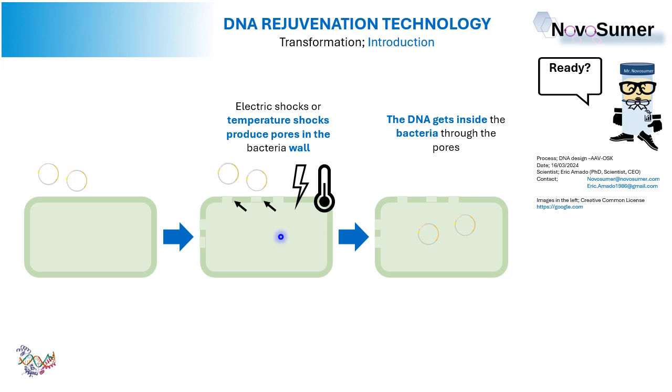Have a look. This slide is a summary of the process. Look here. Now to the left. You see a bacteria cell surrounded by DNA. That is what we do. We just mix DNA and bacteria cells. We mix them together.